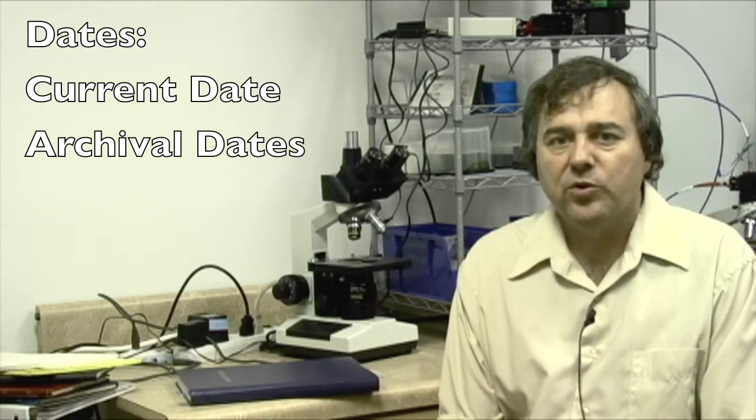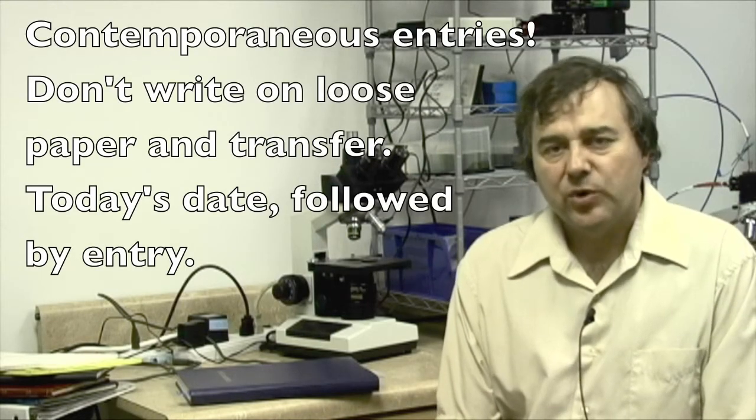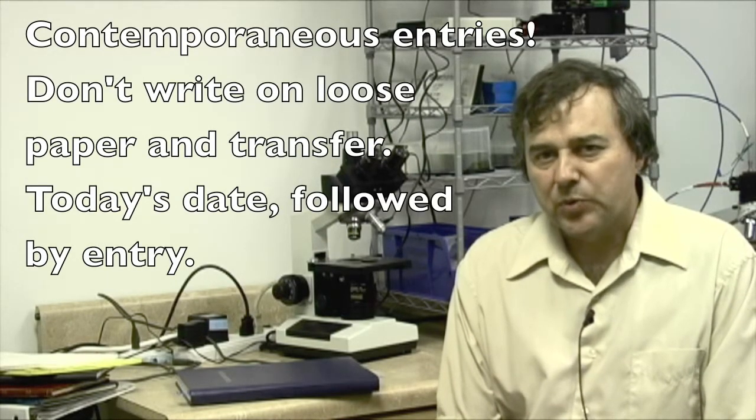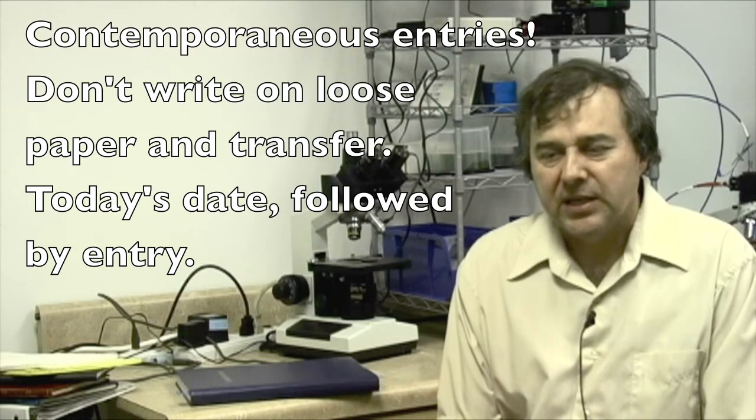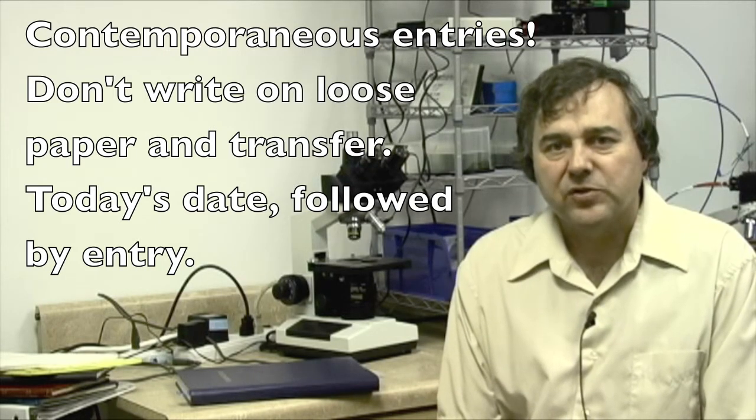Dates: The current date is for today's experiment. Before you entered anything else into it, you would write today's date. Archival dates are for continuation of experiments. Let's say the experiment took two or three days to complete. Maybe today we made buffers for the experiment, and tomorrow we actually ran the experiment.